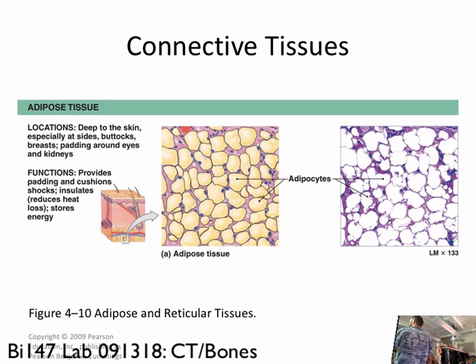All right. And so there's not a lot to see here. There's fat, and there are these little berries, these little dots that you'll see in there. And those are simply the nuclei of the cell. Nuclei, what are you talking about?